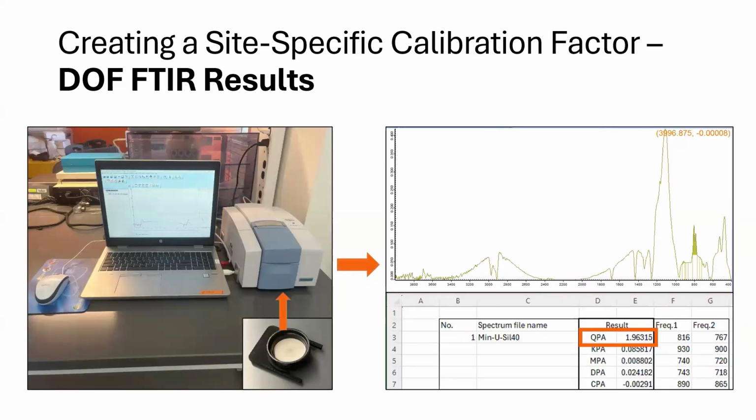These samples will first be analyzed using FTIR. After obtaining your peak area results from OPUS software as explained previously, you will send them to a certified laboratory for standard RCS analysis, such as NIOSH method 7500, to get the RCS masses in your sample.